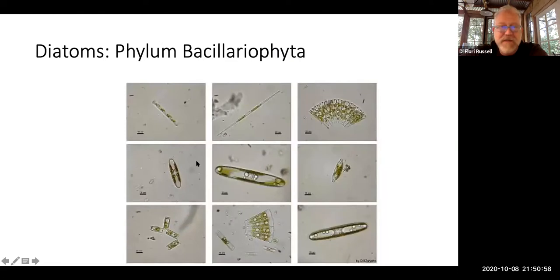Okay, I mentioned diatoms. Here's some more diatom shapes. Once again, they all have this lovely sort of golden color to them, but they have a glass test, silica dioxide test, like a shell that they live inside. And so they have these terrific geometries that are very distinct for every species. They can be sort of long and lance-shaped, oval. There aren't pictures here, but they can be round. They can form long filaments, you know, all in a row.